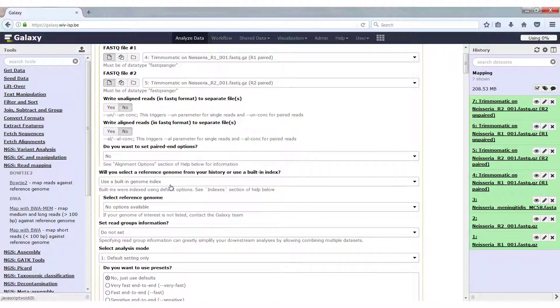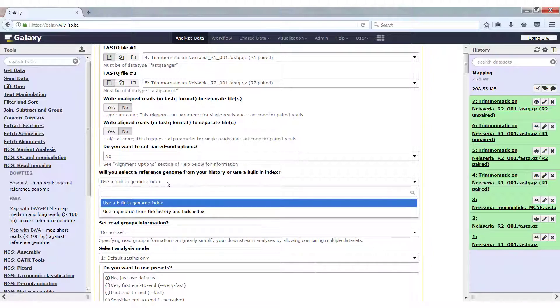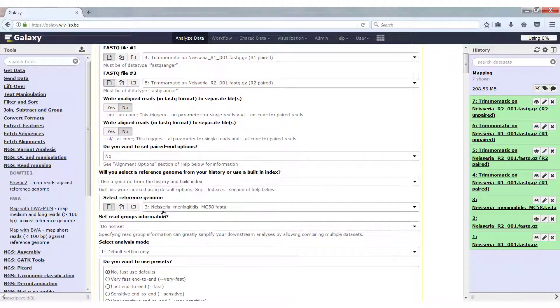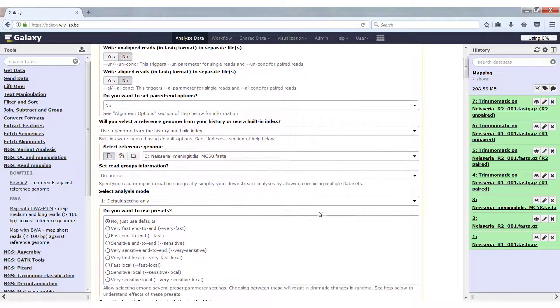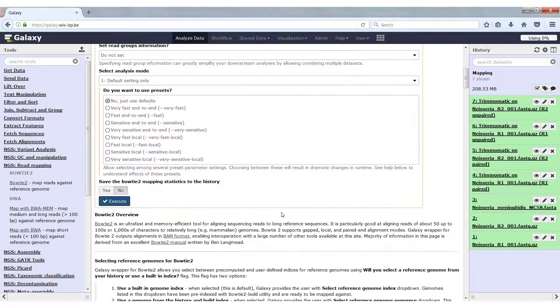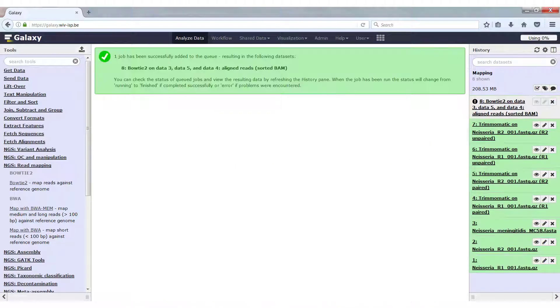What remains is we have to select an index, a reference to map the reads to, and we're going to use a reference from the history, which is the Neisseria meningitidis MC58.fasta that we imported from the shared data. So this is our reference genome. The only thing that remains now is to execute Bowtie2 and wait for it to finish. This will take a few minutes, so I'll fast forward and continue when it's done.